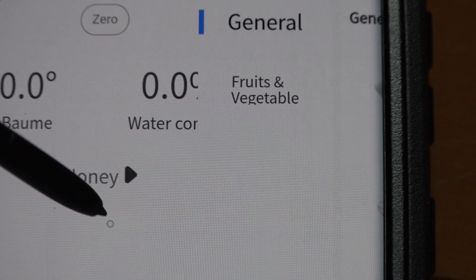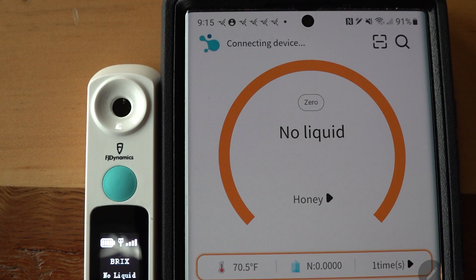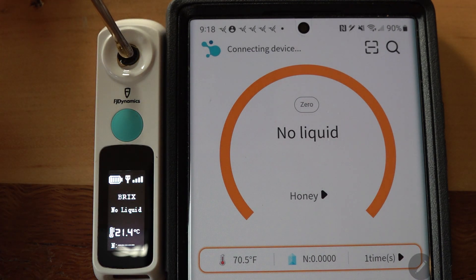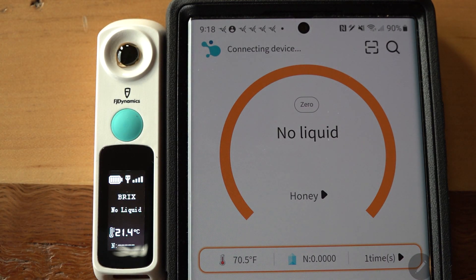I click on honey in the app because that's what I want to know — the percentage of water content in honey. Here's the thing: it shows up as 'honey' on your phone, but it does not show up as 'honey' on the sensor itself, which would be super helpful. I'm putting honey on the device now — we'll talk about where that honey came from shortly. But look at my phone: it says 'connecting device.' This was a frequent problem — it continually disconnects from the refractometer.